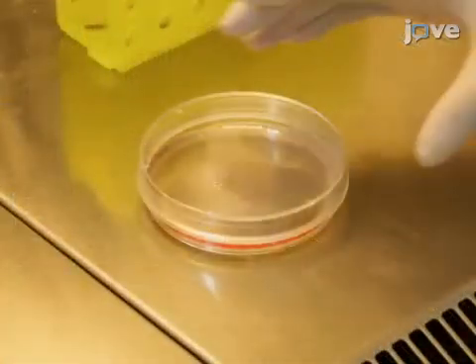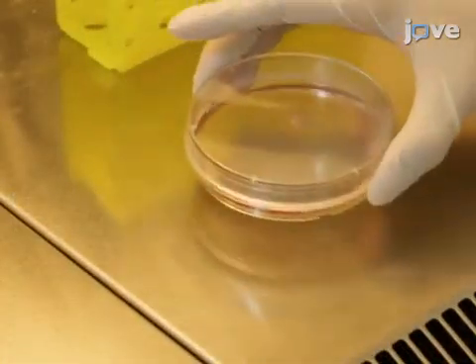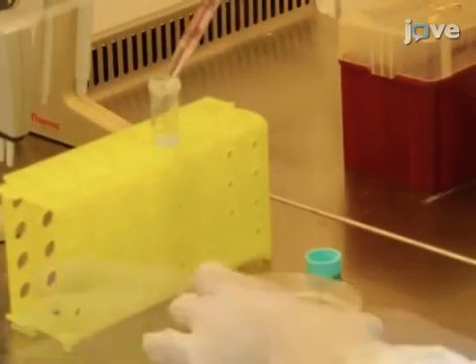Then gently swirl the culture dish a few times and transfer the floating cells into a plastic 15-milliliter conical tube.